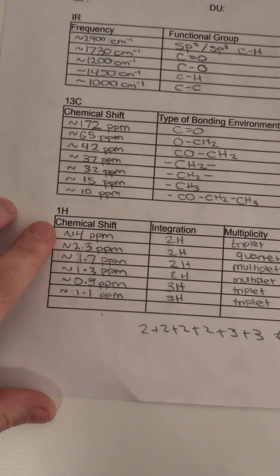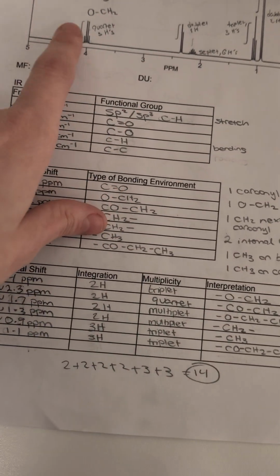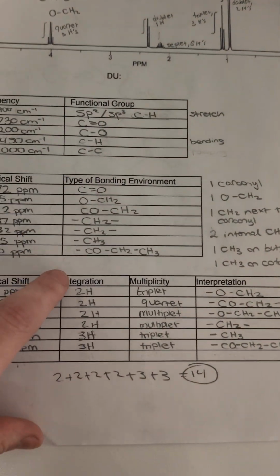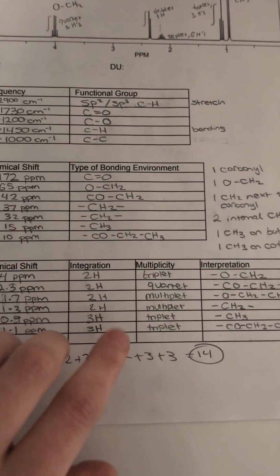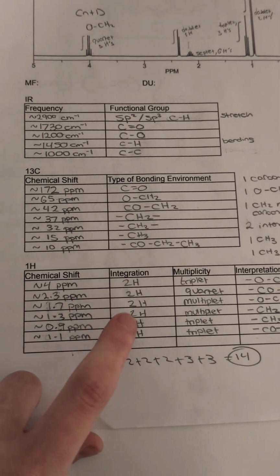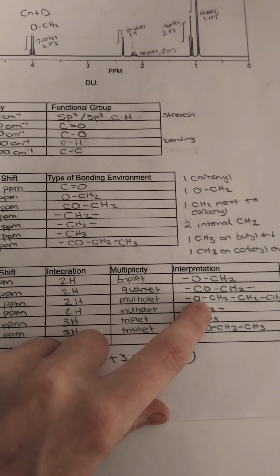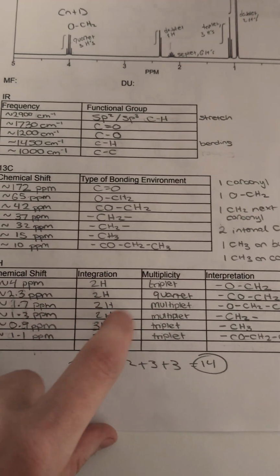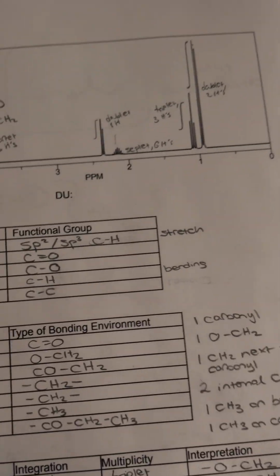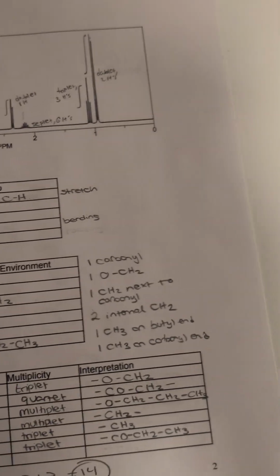So we notice that around a chemical shift of 4, we had an integration of 2H, a multiplicity as a triplet, and that's written down. These are written down incorrectly. I apologize. I just noticed that. But so these, focus on the data table. We see that we have about 6 key moments because 2 are going to be the same with our CH2s, and the primary things that led me to my ultimate answer were the IR spectrum and the 13C NMR spectrum.